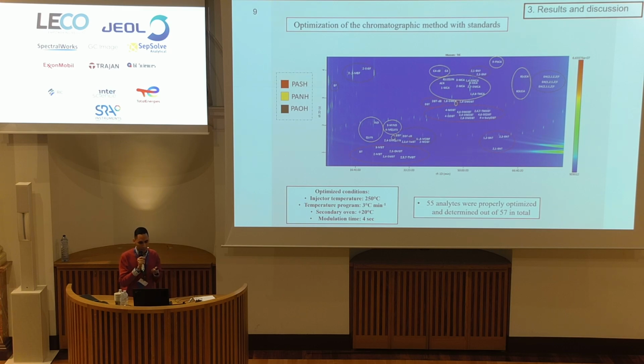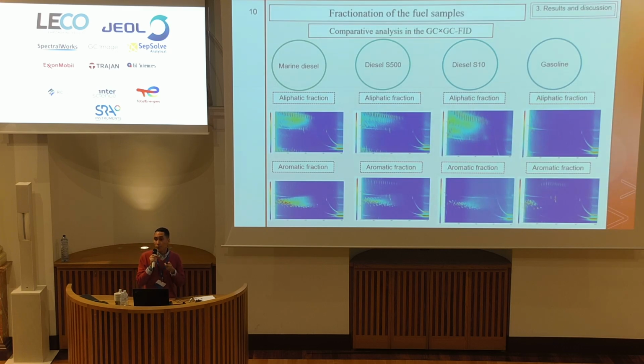After we obtained the optimal conditions for the chromatography method, we needed to evaluate the fractionation of the fuels. For that, after obtaining each fraction, we analyzed it by GC×GC-FID to see qualitatively if this separation was adequate, and we were able to confirm it.